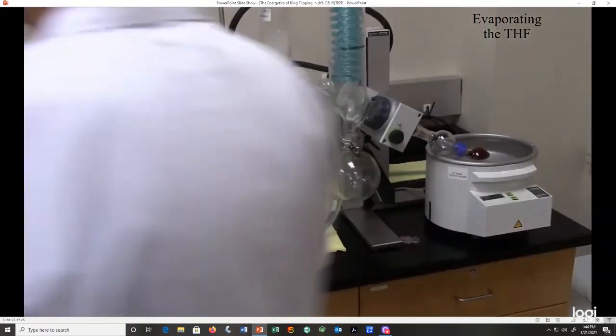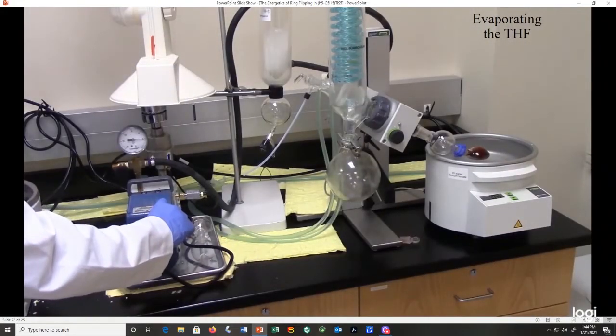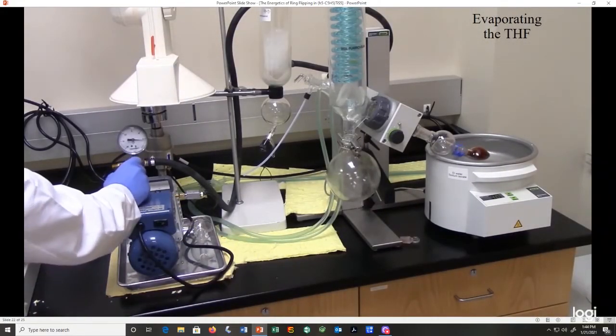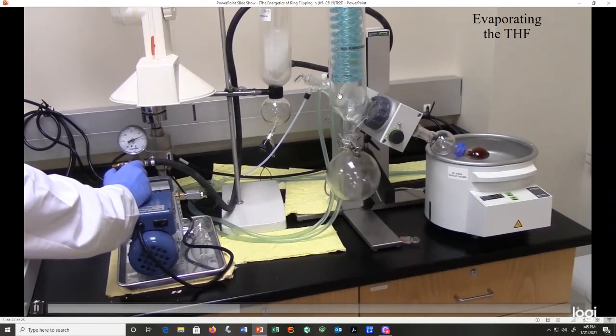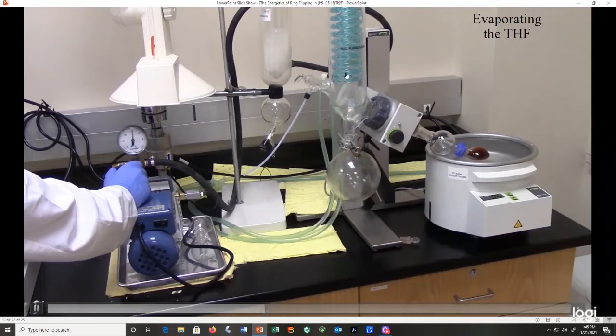So at this point we can go over to the vacuum pump, and we can turn the vacuum pump on, and we can slowly start closing down that valve. And if we keep our eye here on the condensing column, we can see when we've reached the boiling point or when we're getting a good flow of THF that's condensing off of this cold finger into the flask down here.